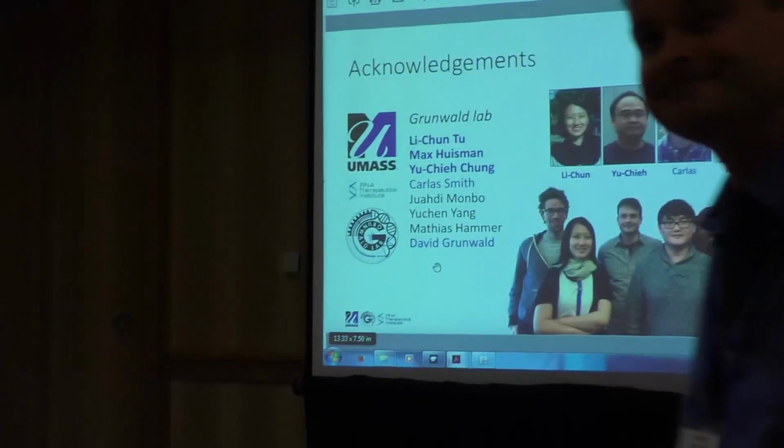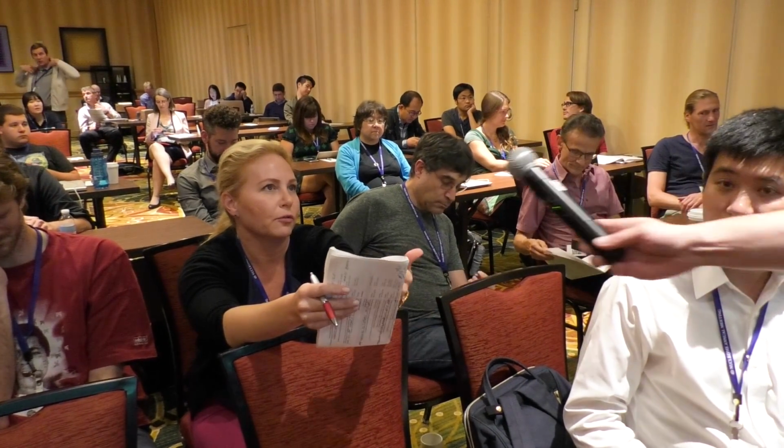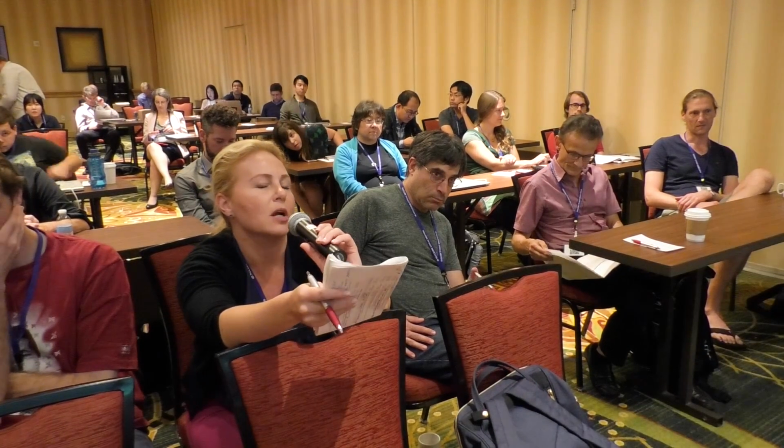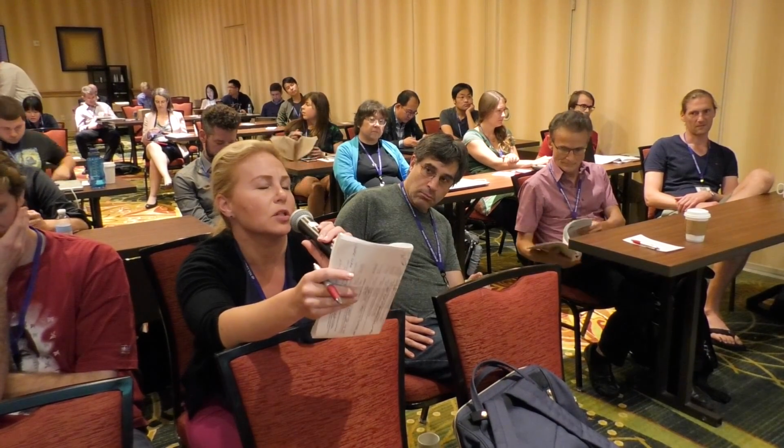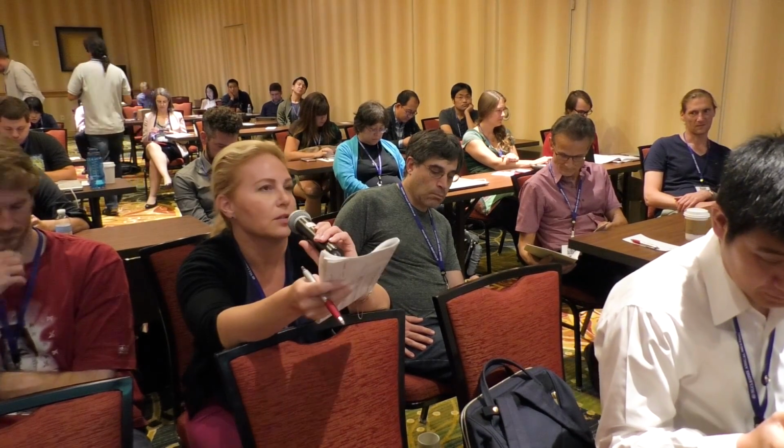Yes. So, for example, I'm running units on the software, and we do FISH. The way I look for overlap, I'm using the same software. The question is, if I provide the images, which I've done, like in Metamorph, and they were corrected for the overlay, to another software, would you usually have the same result, or does it depend on the software?